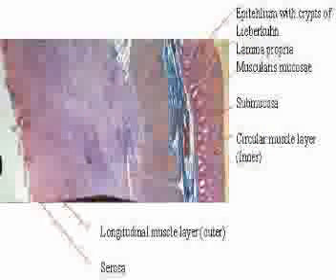Rectum. The stain used for the rectum shows distinct layers of the rectum.